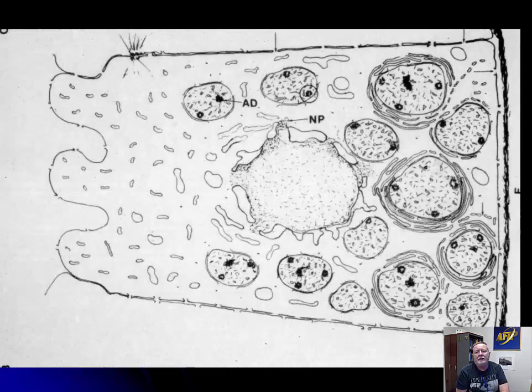Okay, and then finally, we're at the end stage of the cell. We have irreversible change. We have the high amplitude swelling, the accumulation of the calcium within the matrix of these dead mitochondria. There's rupture of the nuclear membrane and an influx of fluid into the nucleus.